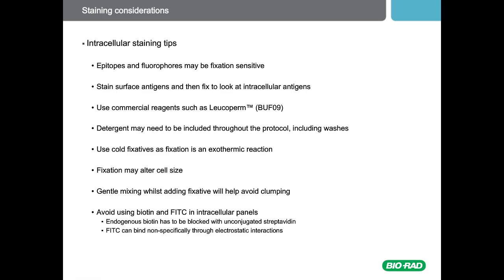The order of the stain and fixation is important. Stain surface antigens before you look at intracellular antigens, as the permeabilization can affect surface staining.